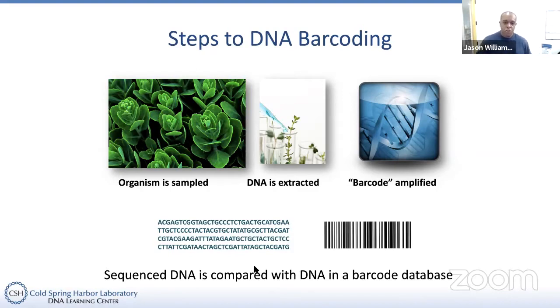Then we need to actually do DNA extraction. Now, if we were doing the wet lab, what you would be doing is you would go ahead and extract the DNA, and there's a variety of chemical ways that you could do that. You'd also be using a thing called PCR to amplify that. And if you have some AP Bio background, you'd be able to see that. The next thing is that once you sequence it, and we'll talk a little bit in detail, then we could go from the sequencing to being able to actually get those As, Cs, Ts, and Gs.